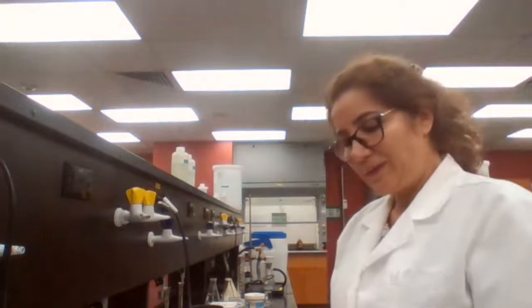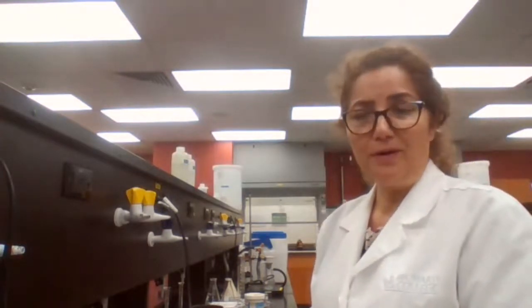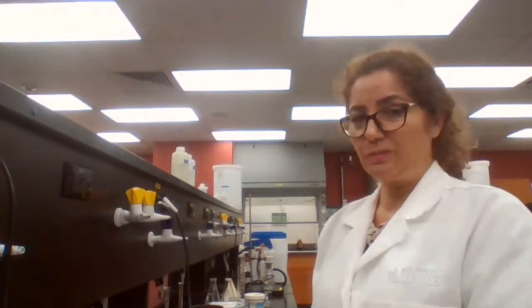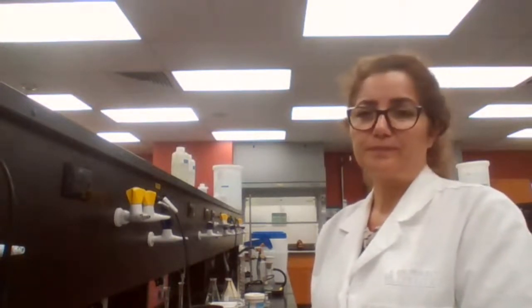Now, what are the characteristics of a proper recrystallization solvent? Because you have to first choose a proper solvent. The procedure that is given to you for recrystallization is already proven by someone else. What are the characteristics of a proper recrystallization solvent?